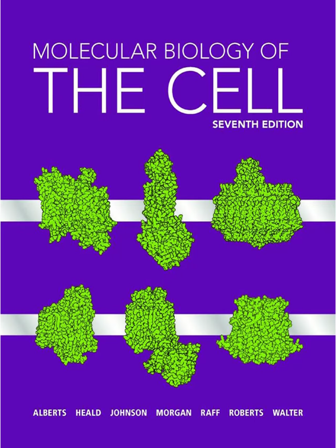It's similar to a standard light microscope, but with a few key additions. A powerful light source, like a laser or arc lamp, two sets of filters, an excitation filter that selects the wavelength hitting the sample, and an emission filter that selects the wavelengths reaching the detector, and usually a dichroic mirror.